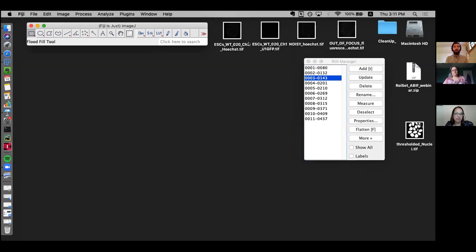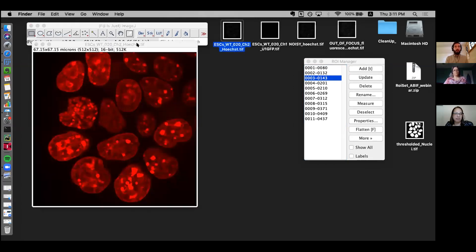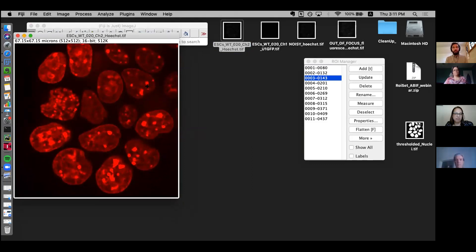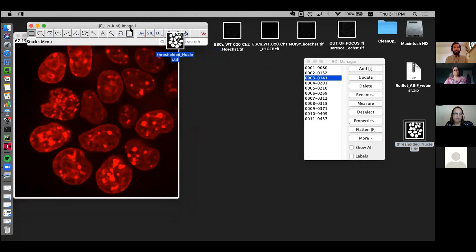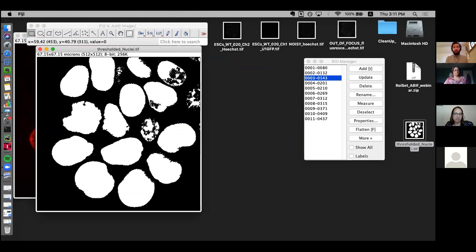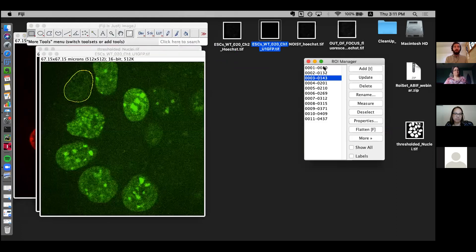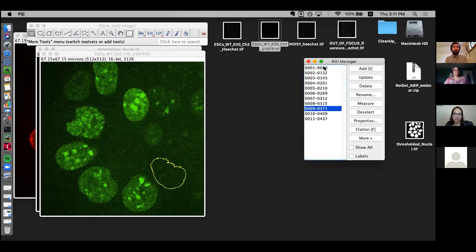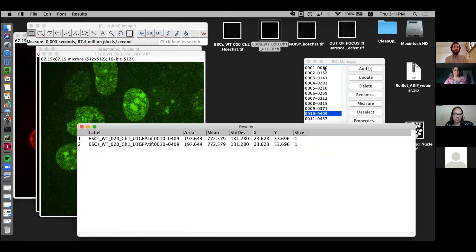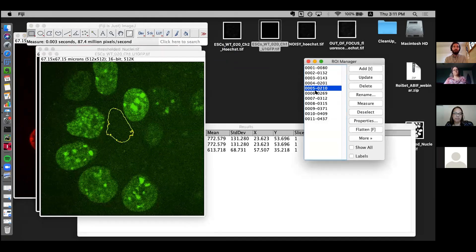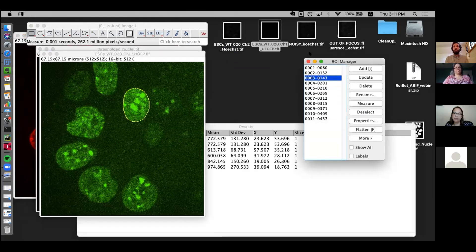Just to give a brief overview: we want to take an image of nuclei and segment them to get individual shapes — creating a binary image. From those shapes, we apply them onto a different image, say a GFP image, get the shapes of those nuclei, and extract the intensity information from those different areas.